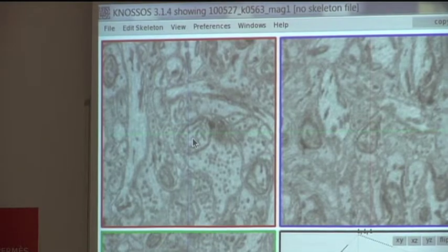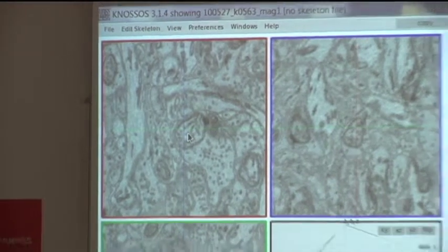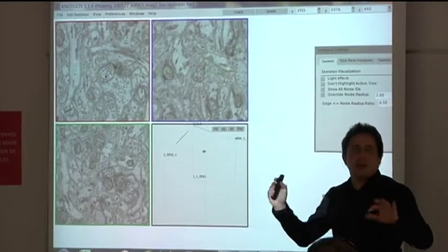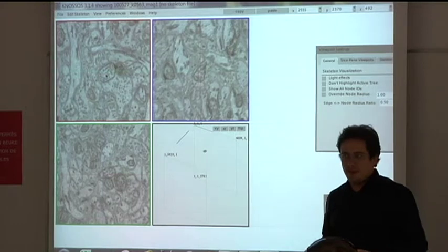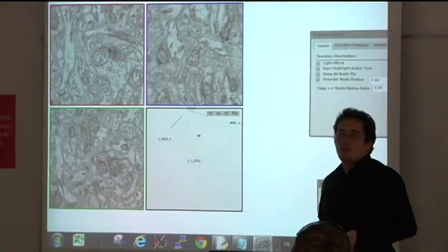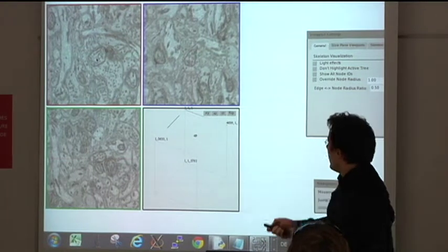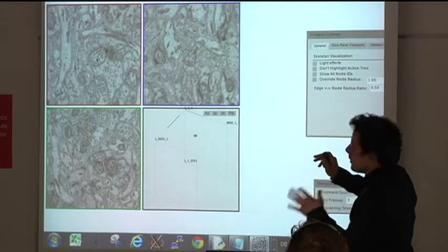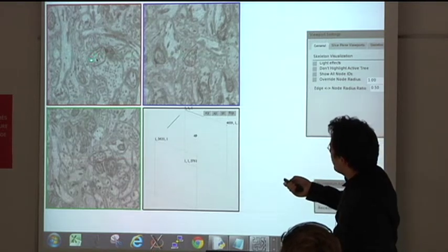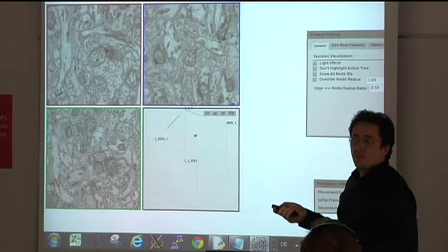Because what we'll do now is, I promise you, within 30 to 60 seconds, you'll be what we call experts at EM data annotation, and that will be a proof of the performance of your visual systems, okay? So we can agree that you didn't see anything right now, right? Okay, so now we're going to get there. So this is a mitochondrion, okay?